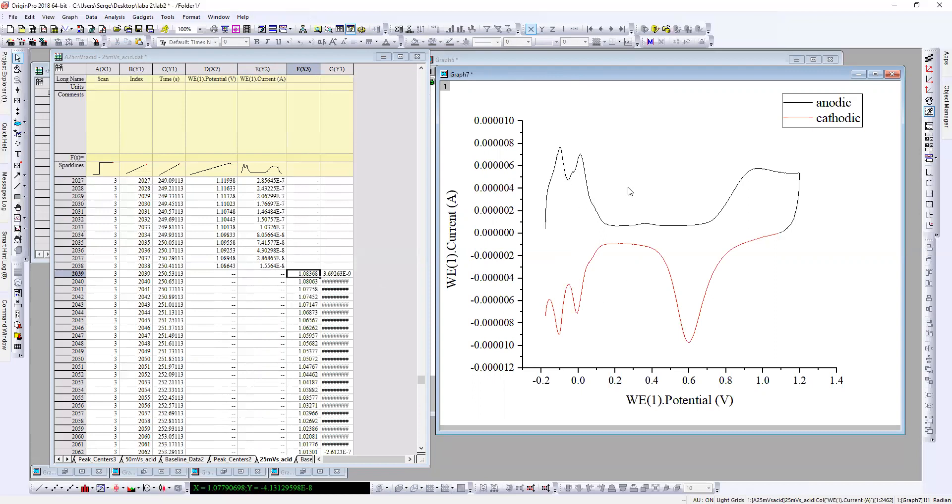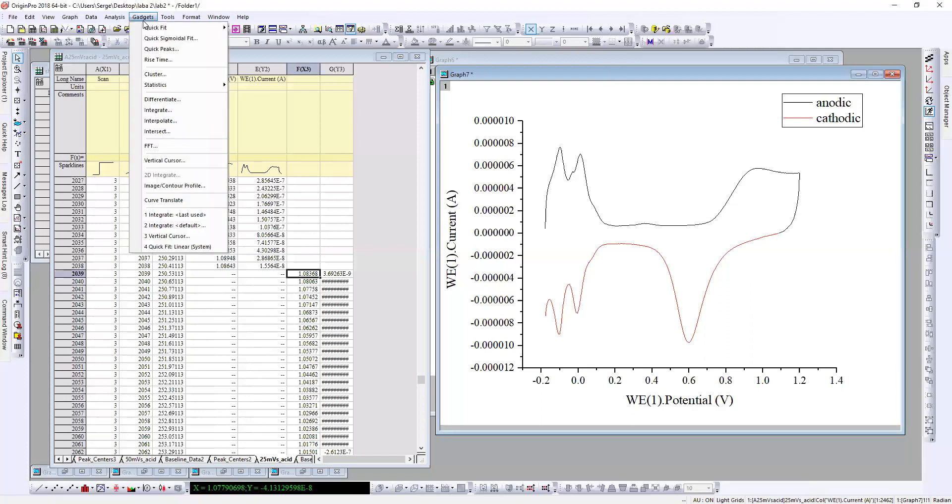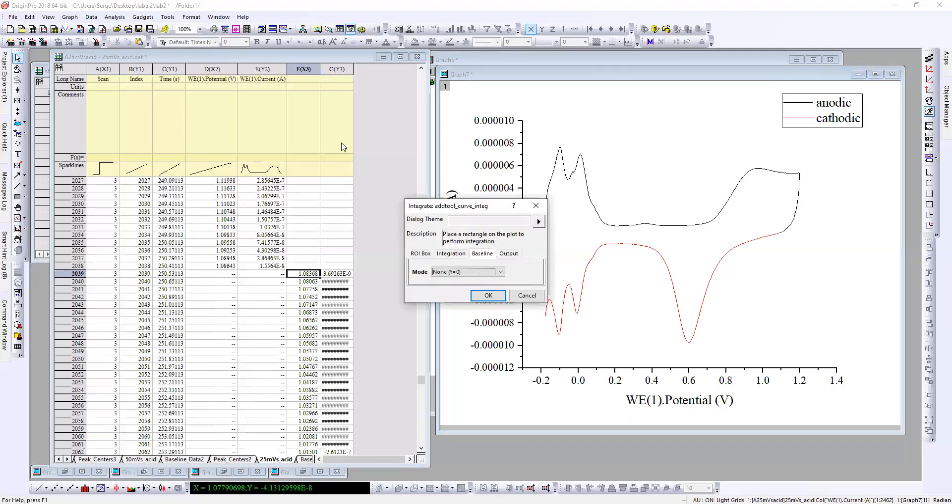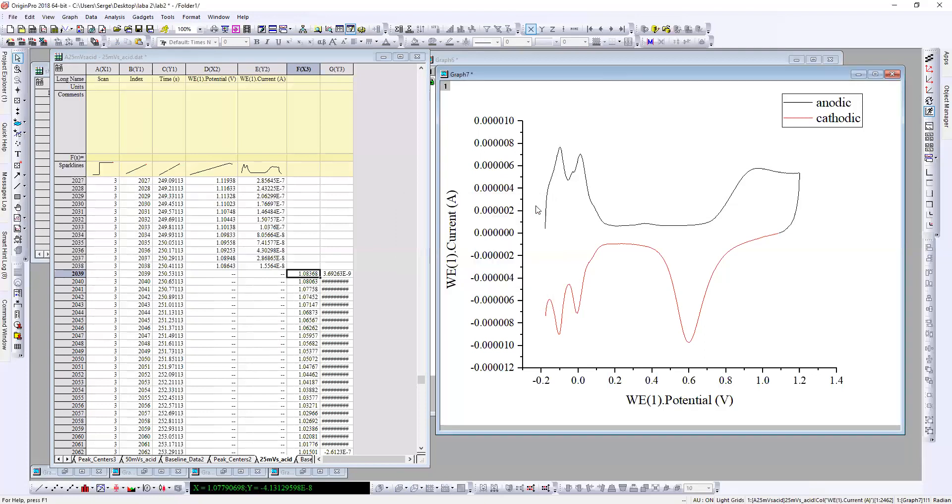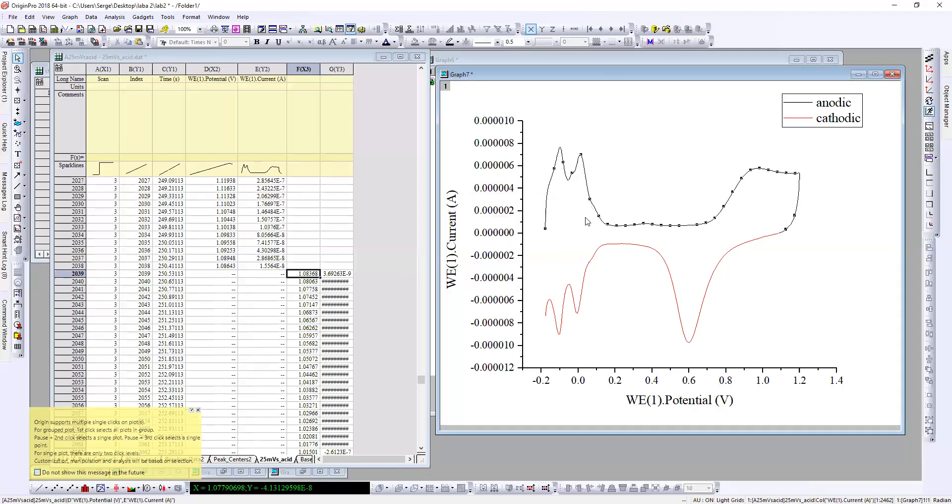Okay, now for integration what I need to do is go to gadgets, integrate. Okay, just repeating the procedure because it's very fast. We need to use integrate curve.